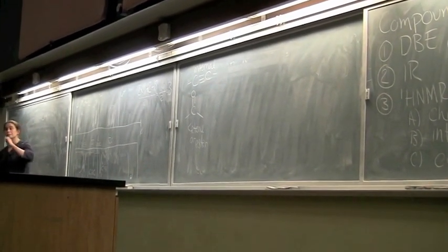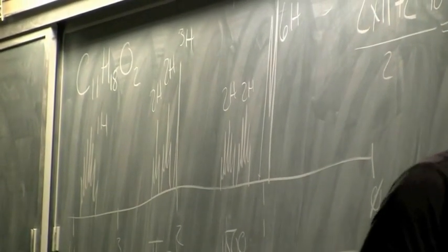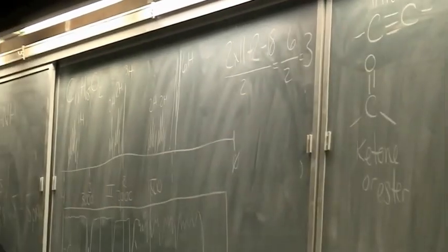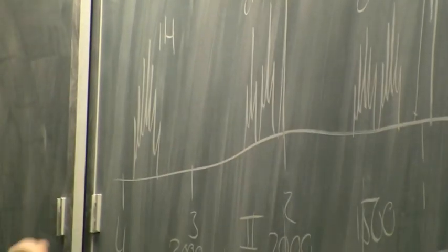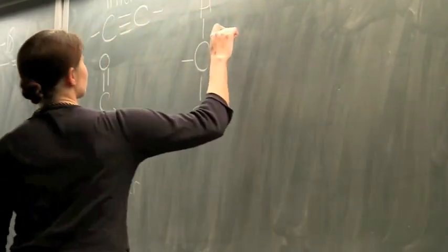So working left to right, we see first off CH, 1 hydrogen attached, sp3, 4 bonds. It's way down there at like 3.9, 3.8. It's got something really electronegative attached to it. We look at our formula, what we have is oxygen. So we know that we have an oxygen attached to that. We look at our coupling, we have 1, 2, 3, 4, 5, 6, 7 little subpeaks. 7 subpeaks means by the n+1 rule, n+1 is 7, so n must be 6 neighbors.